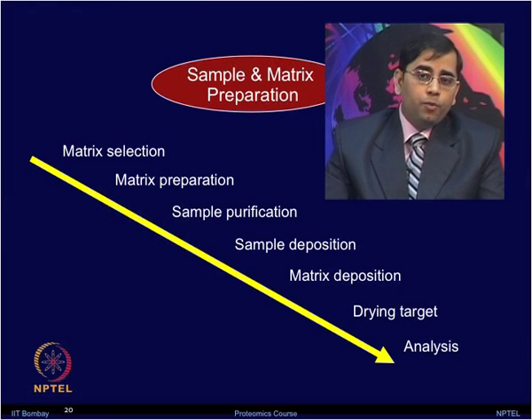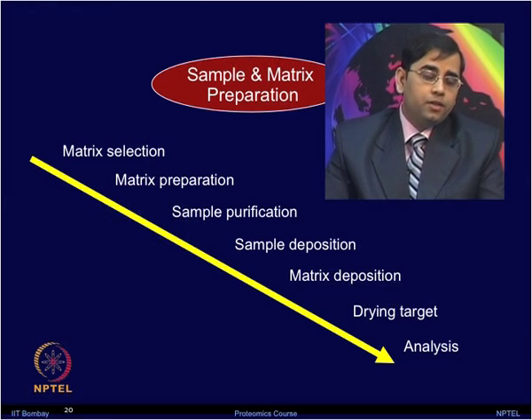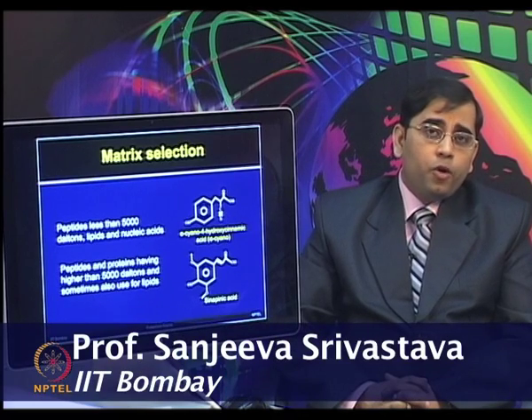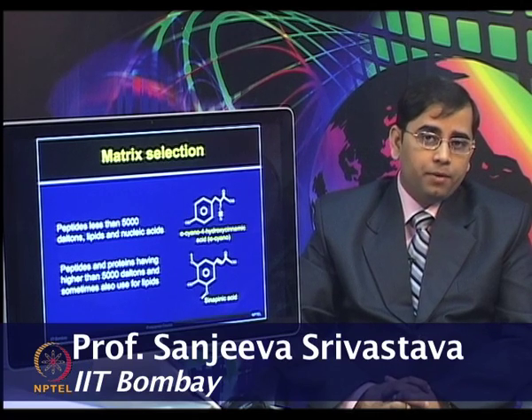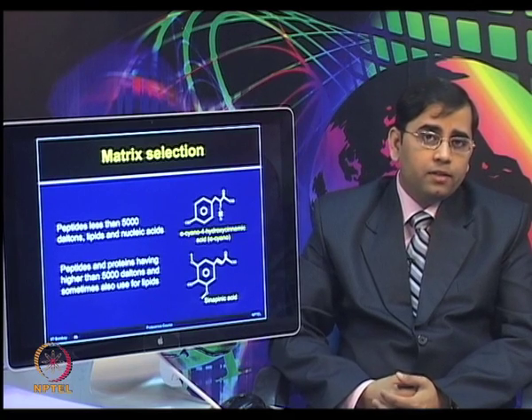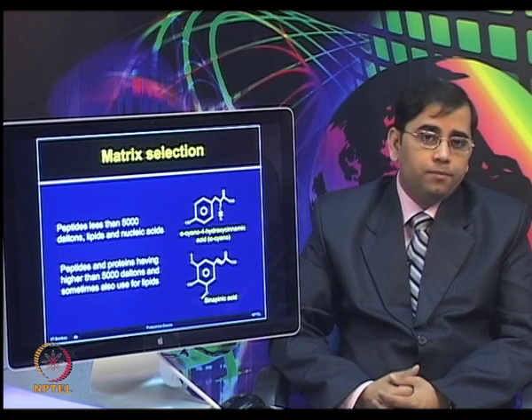And then once both sample and matrix are deposited on the MALDI target plate, you are ready to do the drying, and then the plate can be used in the MALDI-TOF instrument for further analysis. Let us first talk about matrix selection. The important step in MALDI-TOF analysis is selection of the appropriate matrix for the sample. The matrix selection mostly depends on the molecular weight of the target to be analyzed and often the type of application which you intend to do by using these instruments.